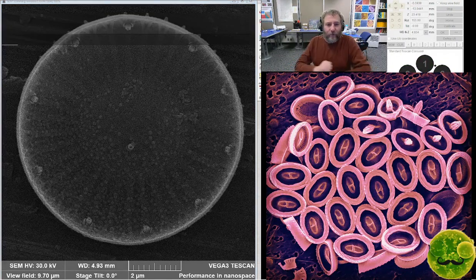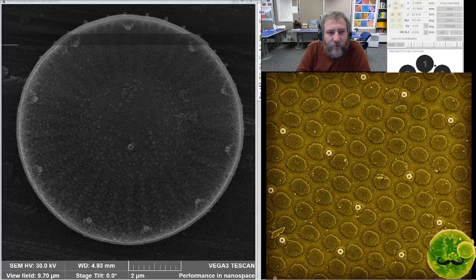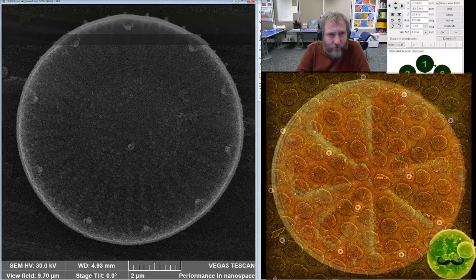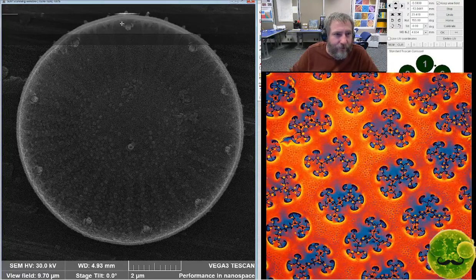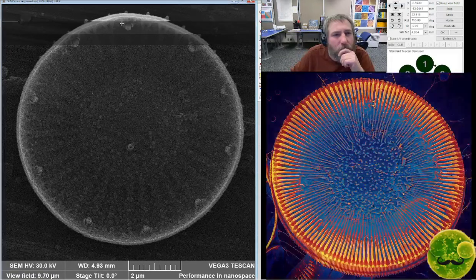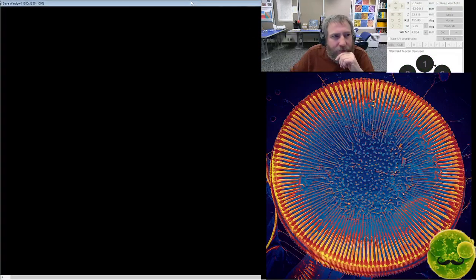All right. I'm going to let this picture get collected, because I'm kind of curious about what this could be. And I'm collecting it on a higher resolution than usual, which means it's a little bit slower beam. But once I'm sure everything is clean, I'll start it. And that's a 10-minute photo.